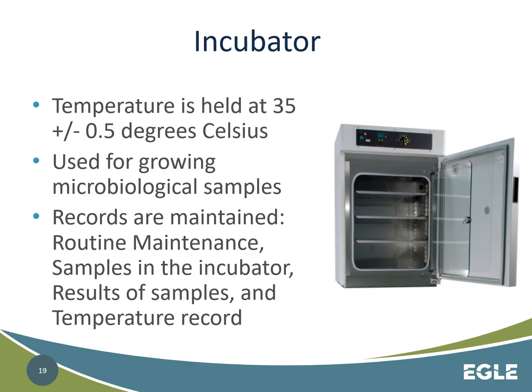They're also going to record temperatures twice a day in this logbook. They're also going to have a maintenance record book, and the maintenance record book is going to be any maintenance that's done to this, and it's also going to be about the calibration to make sure that it has been checked and calibrated to make sure that the incubator remains in specifications.